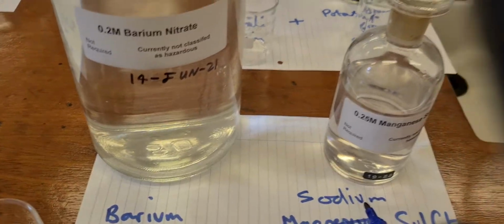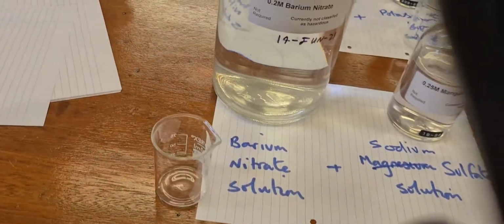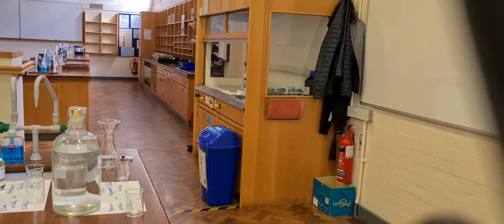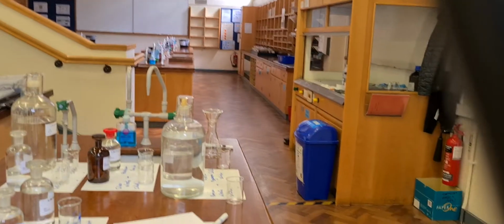These ions, sodium ions, magnesium ions, it doesn't matter so long as it dissolves. And magnesium sulfate does dissolve. So this experiment will work. And I'm going to show you. Like this. Maybe I'm going to have to do this kind of thing.